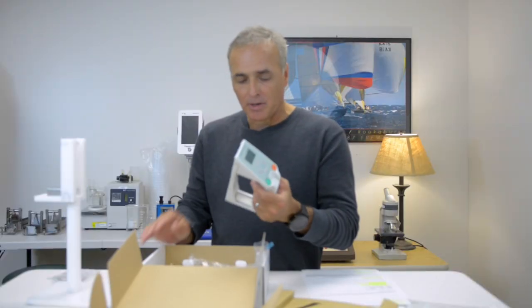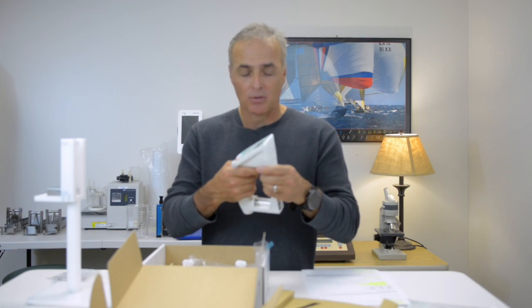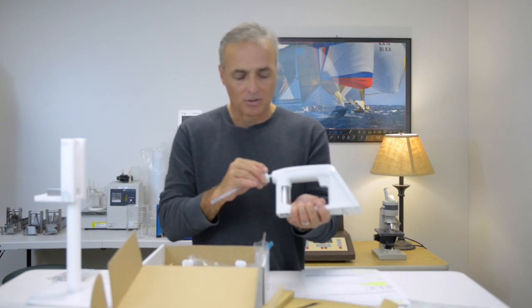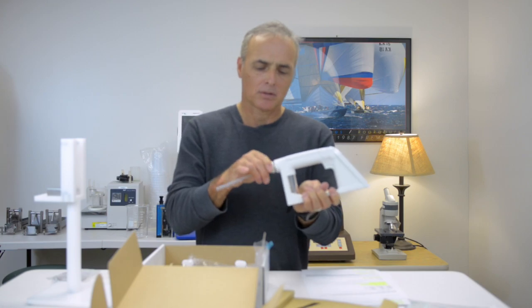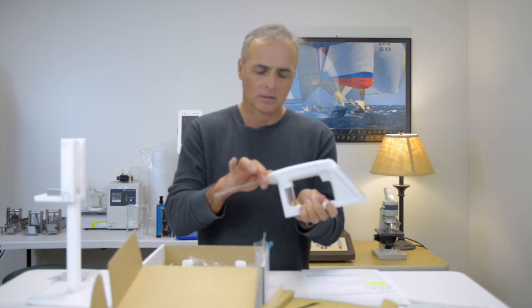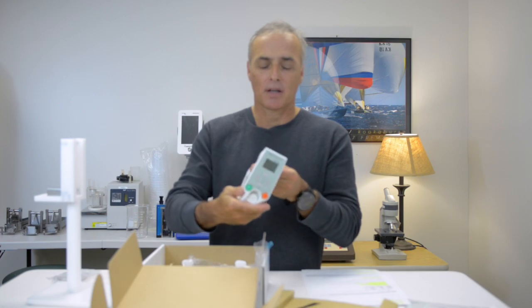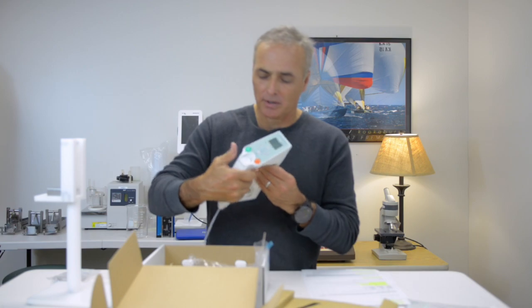Taking the density meter out and assembling it is rather easy. This is the main unit — you hold it like this. You have a trigger here. I've inserted a nozzle in here already, and it just screws in like this. The battery compartment is right here in the back. You've got an LCD screen here, and you've got your buttons and your trigger here.